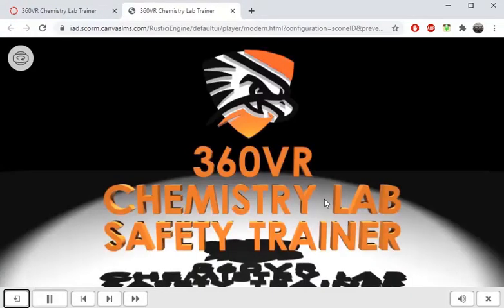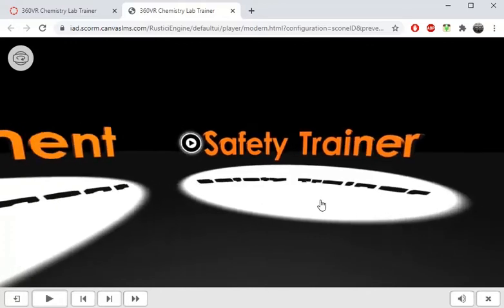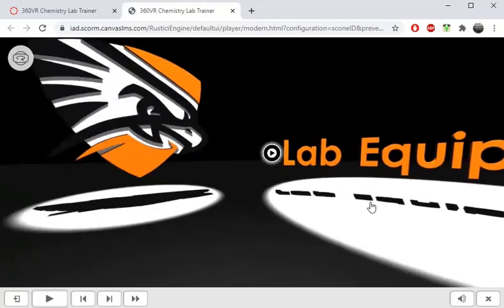Let's go ahead and open the trainer. It's HTML5 based, so there's no worries about Flash going away. This video is being made in October 2020. The first item we see is a quick title screen that automatically advances to our first menu. For computers and tablets, the view I specified is the view students will see initially.